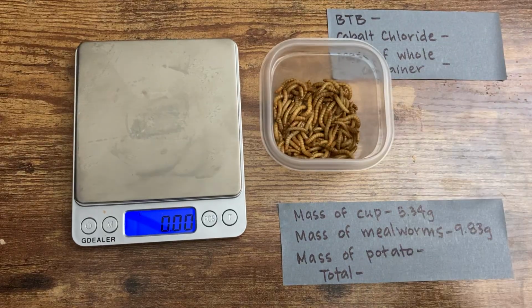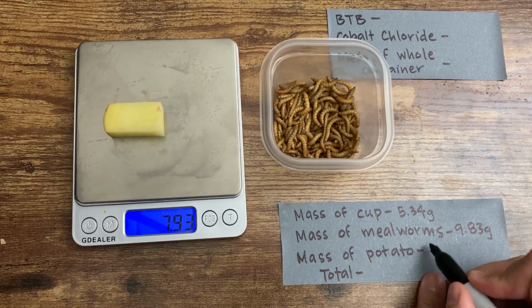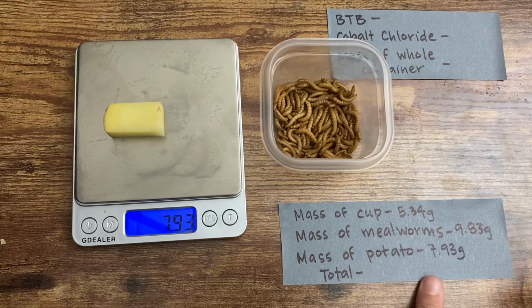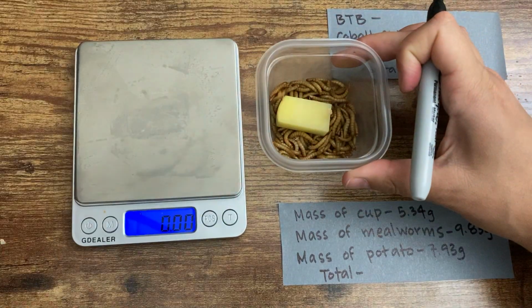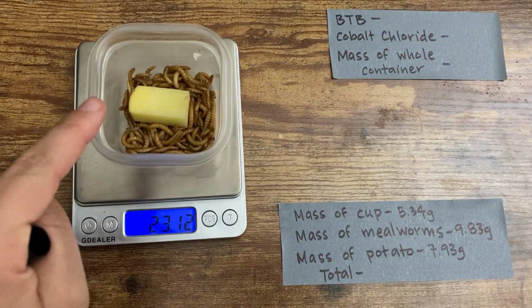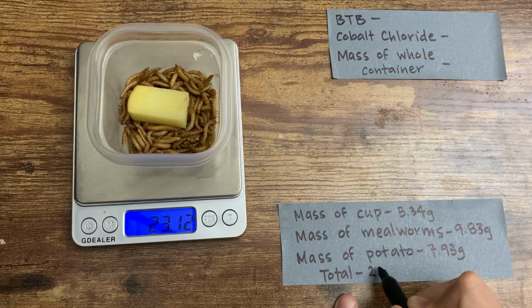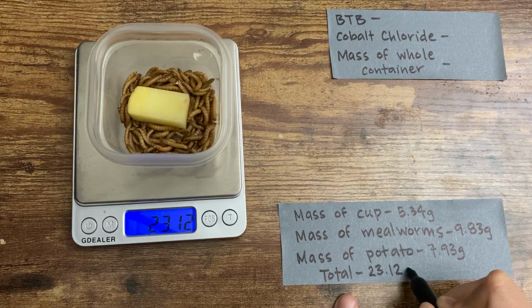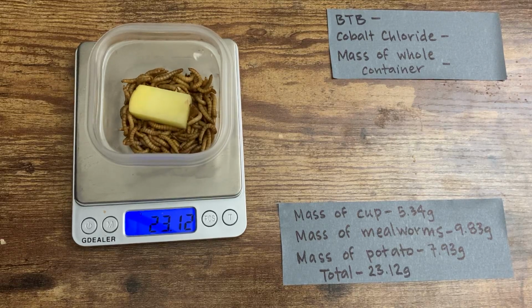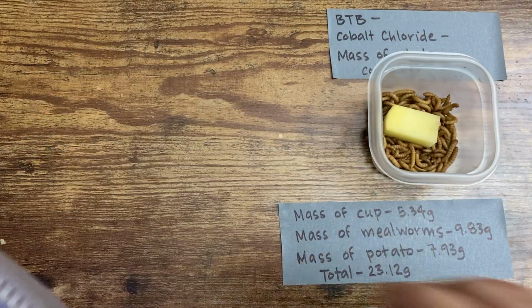All right, we're gonna set those off to the side, reset my balance to 0, and I now need the mass of the potato. The potato is the food that the mealworms are going to eat. So the mass of my potato is 7.93 grams. I'm gonna put the food in with the mealworms. Don't worry, they're just fine. Put all of this, so cup, mealworms, and potato on the balance, and the total now comes to 23.12 grams.